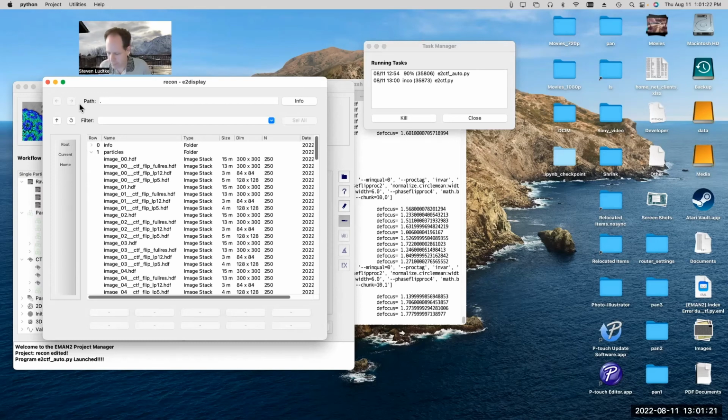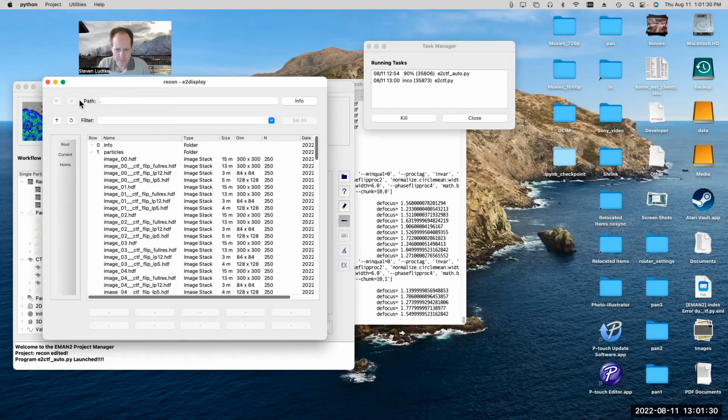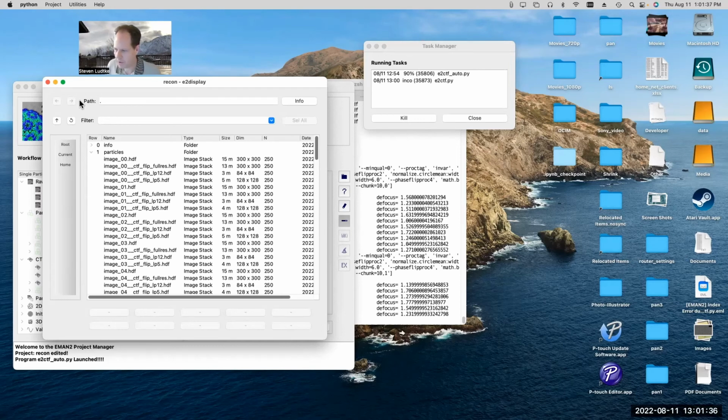Anyway, I guess what I'm saying is there are some cases where there are complications, but for 2.5 to 3.5 angstrom resolution reconstructions of typical particles, it's not something to worry about.